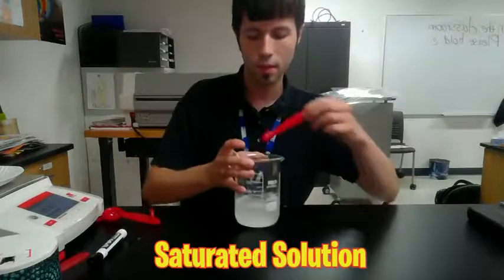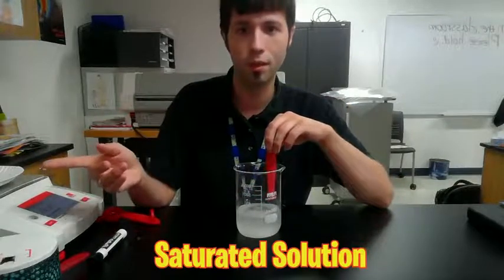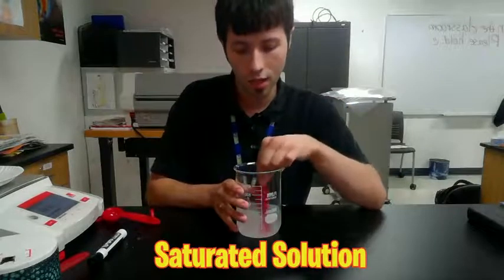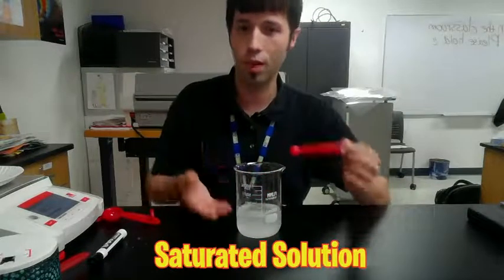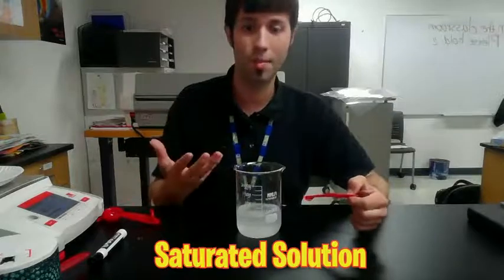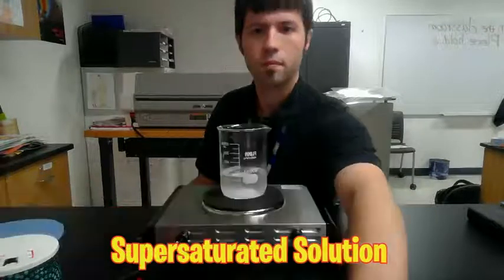What I'm going to do is heat this up. I have a hot plate over here. And I'm going to show you that you can actually change the solubility constant depending on the temperature. So if I raise the temperature of this water, this will actually allow me to add more salt. And so I'm going to show you that in just 1 second.